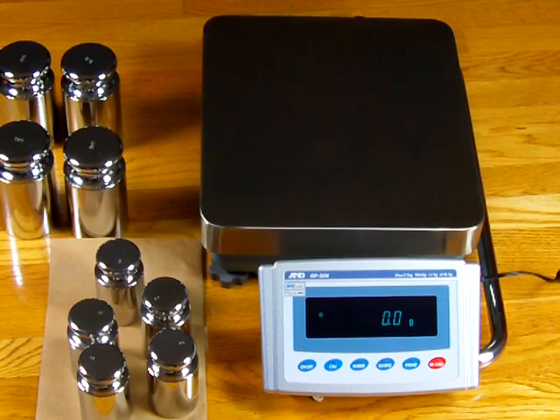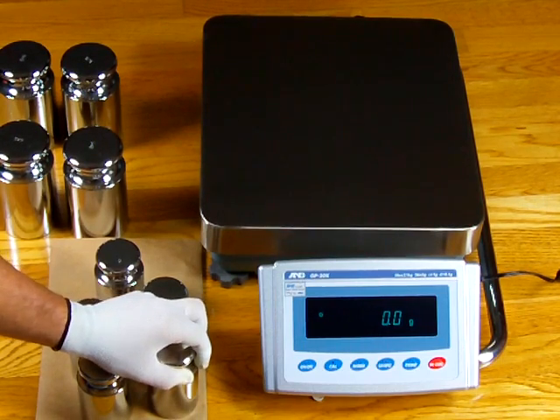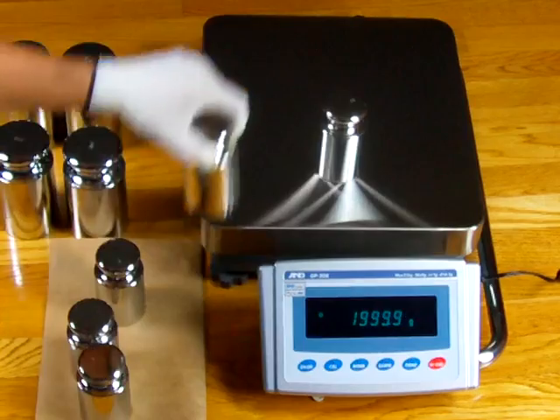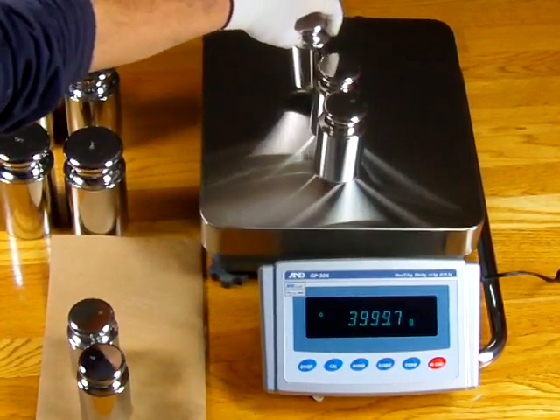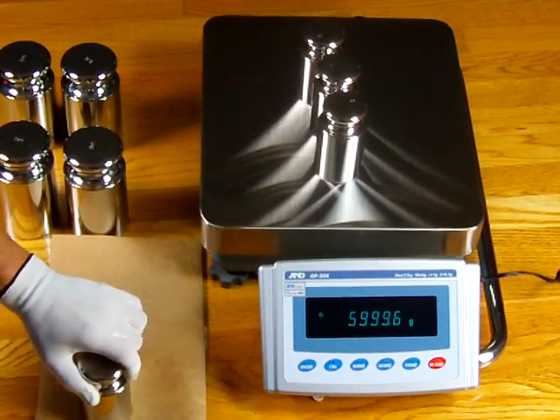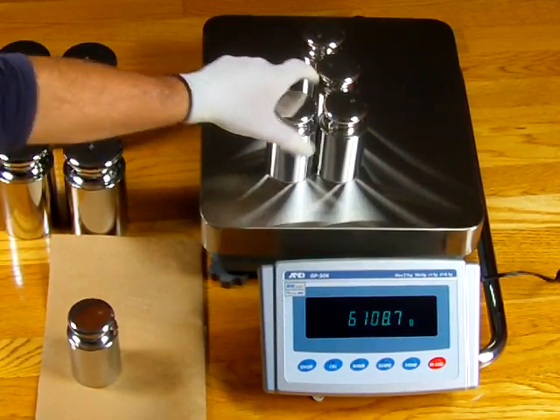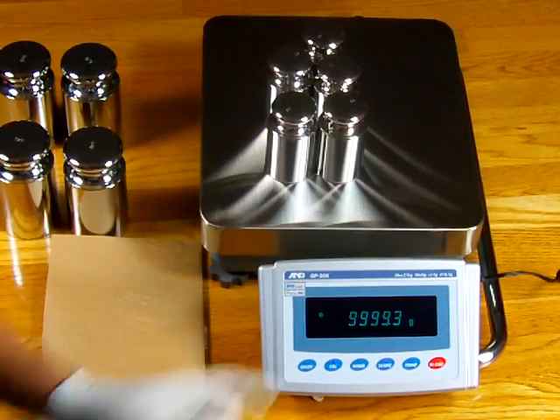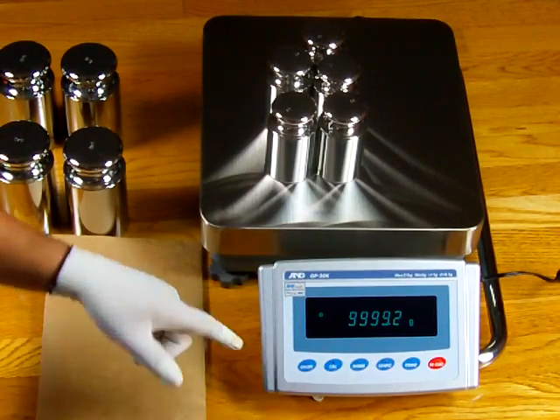You just saw how this scale was right on the money. What happens with the GP series is when you do an internal calibration, you walk over your last calibration set points. Using these ASTM Class 1 certified 2-kilogram weights, I have 2 kilograms on and it's off by 3 tenths of a gram. Adding another, I'm off by 4 tenths. Another — off by 6 tenths. Another — off by 7 tenths of a gram.